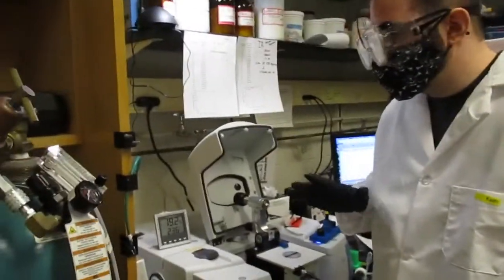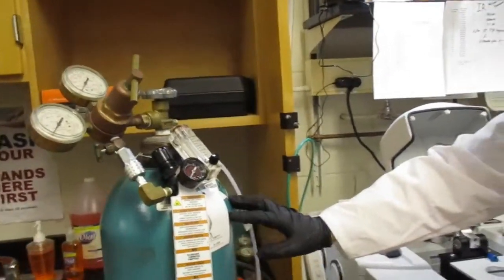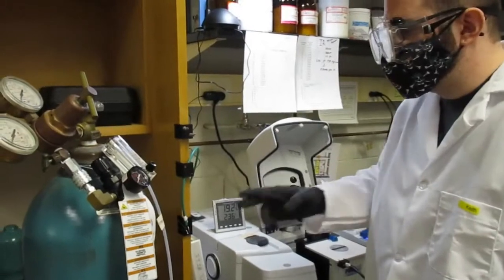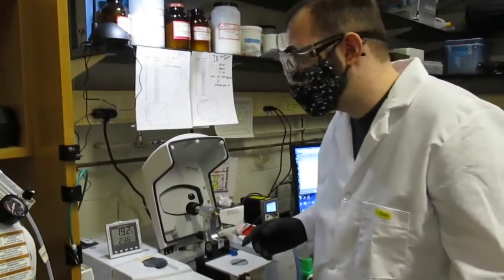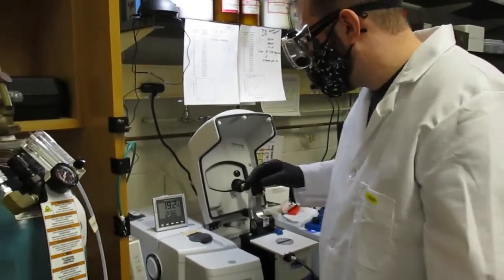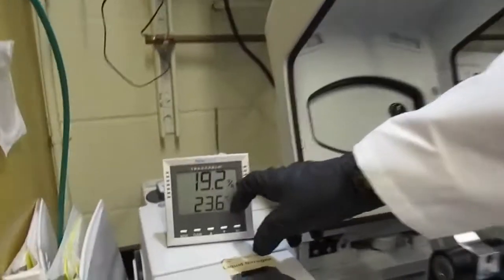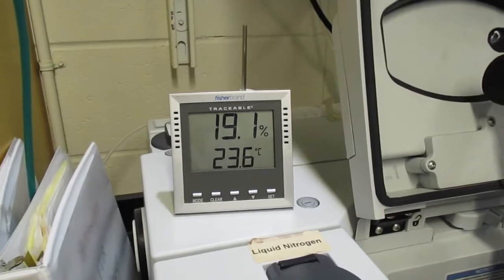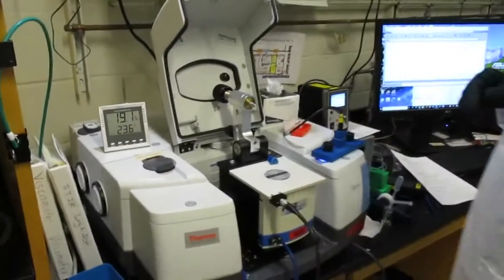What I want to talk about briefly is we have this tank of nitrogen, compressed nitrogen, and this is used to prevent condensation occurring within the instrument. But generally it doesn't have to be used unless the relative humidity, which is displayed on top, is above 70%. Since it's below 70%, we don't have to run the nitrogen gas.